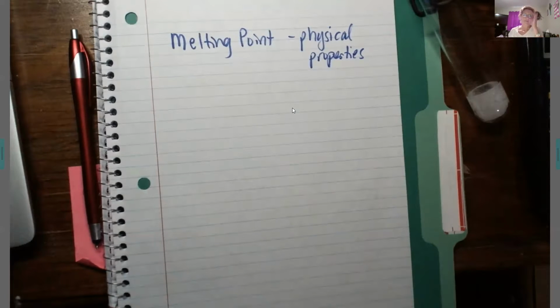So this is a fantastic lab to get you into learning the basics of chemistry and the basics of going to lab, using lab equipment, and learning how to light a Bunsen burner, how to read a thermometer, how to boil some water with some lab equipment. So I'm going to do this lecture here for you. And then in the classroom, I'm going to show you how to do the lab setup, okay? And we'll also take a picture of that and post it on the Google Classroom so that you can see it.